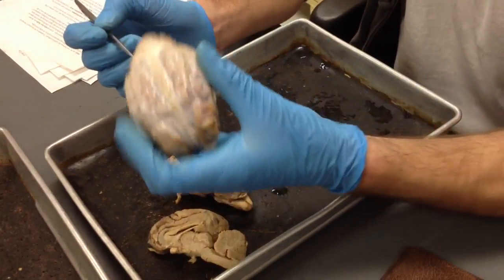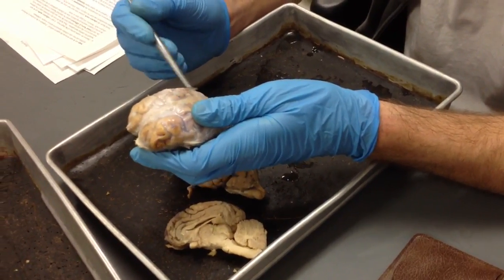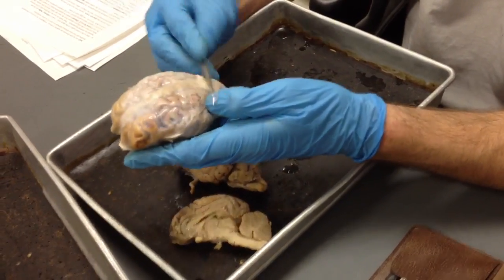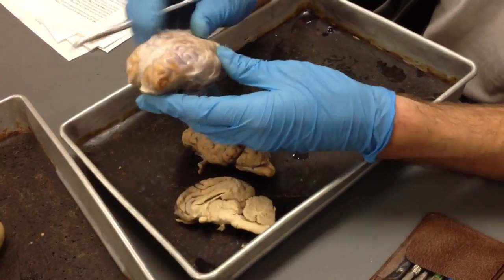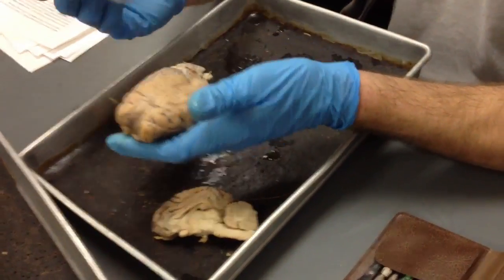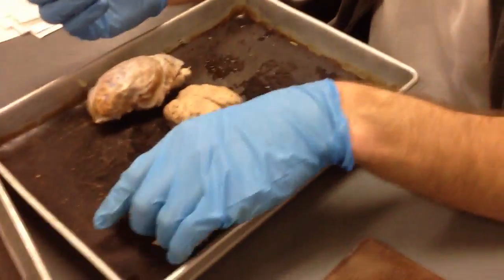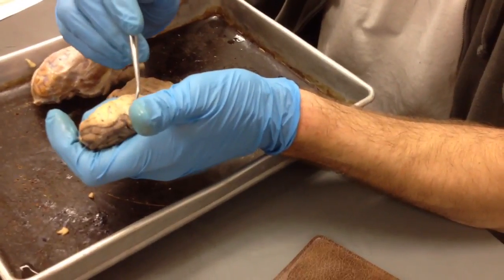The arachnoid is our other meninges, and it runs between the pia mater, which is covering all of these, and the dura mater, vertically with cerebrospinal fluid flowing through it. But when we remove the dura mater, the arachnoid falls down over the pia mater, and you can only distinguish between the two in these sulci.